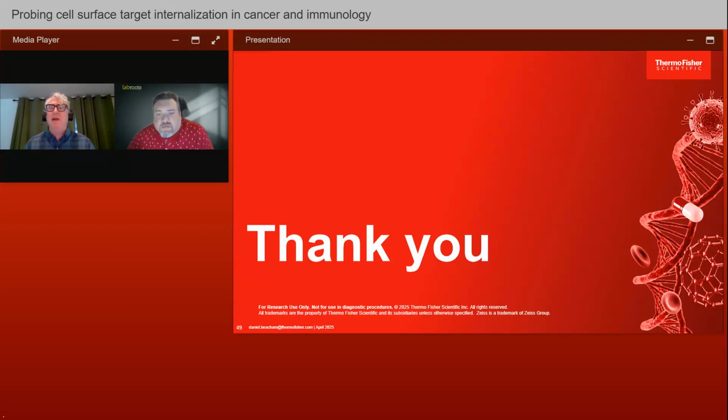You need those intact gradients. You need those active pathways. You don't know when it's going to happen with every new antibody you're screening. So you've got a 384 well plate of novel primaries, and some of them may do their job in the first 10 minutes, and others might take overnight. And so being able to monitor continuously can matter quite a bit.